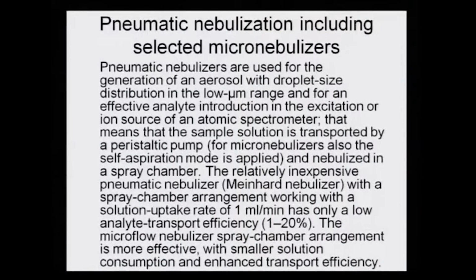The relatively inexpensive pneumatic nebulizer, the Meinhard nebulizer, with a spray chamber arrangement working with a solution uptake rate of 1 ml per minute, has only a low analyte transport efficiency. So, it passes the analyte slowly, and only 1 to 20% of the analyte is transported.